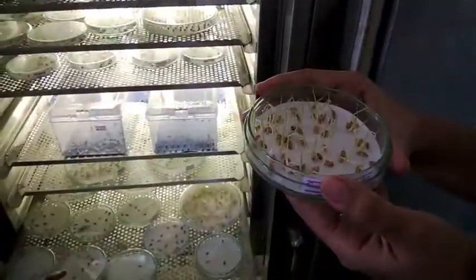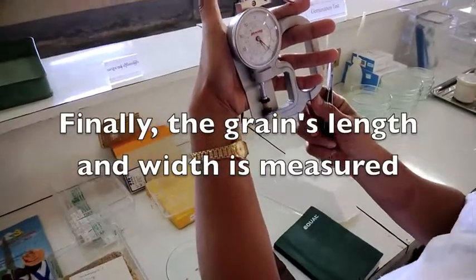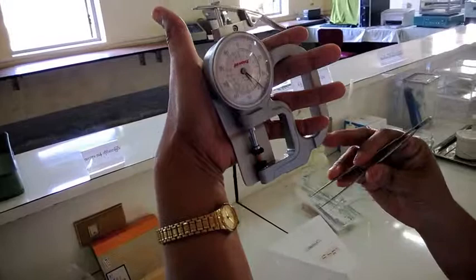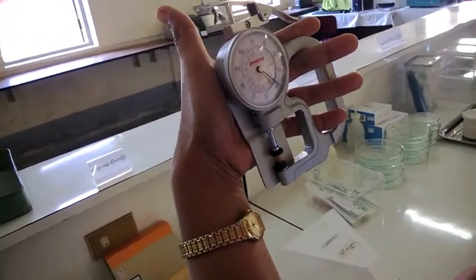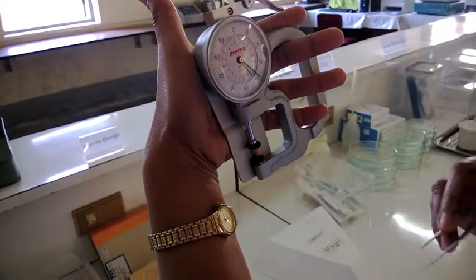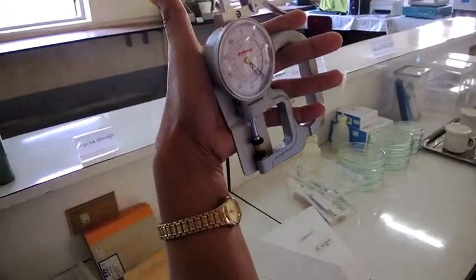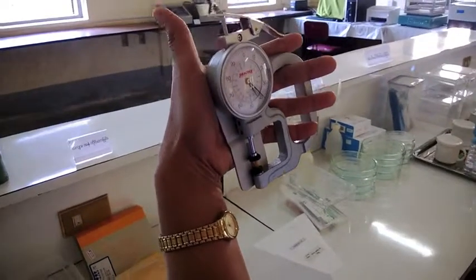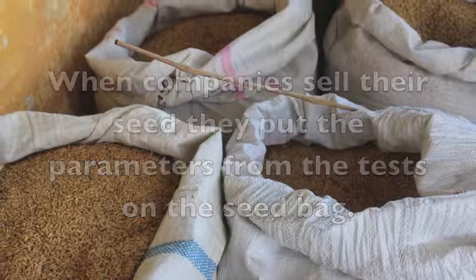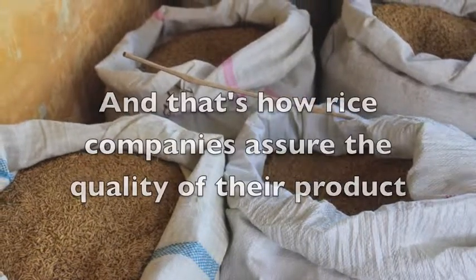This is to measure the length of the grains. In this particular sample, the grain measures 8.3 mm, which would be classified as long grain.